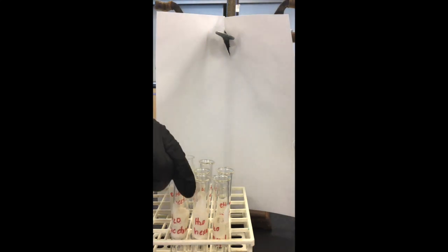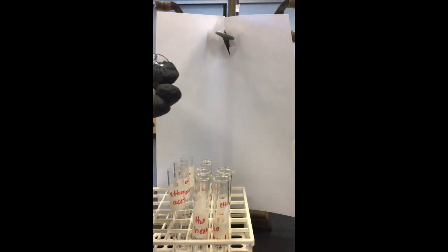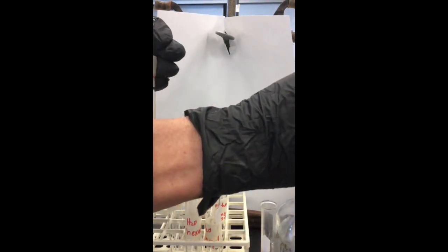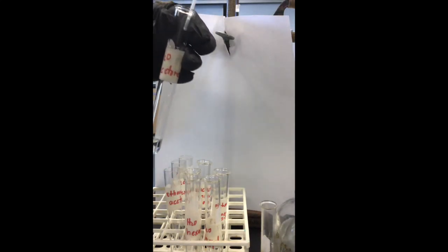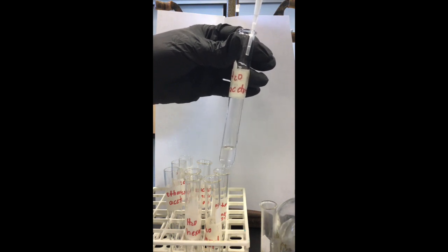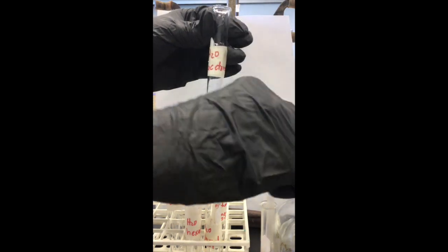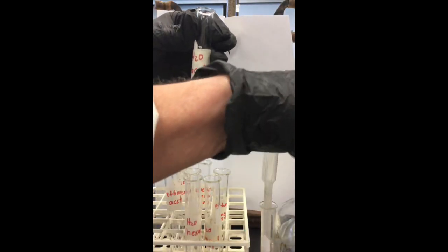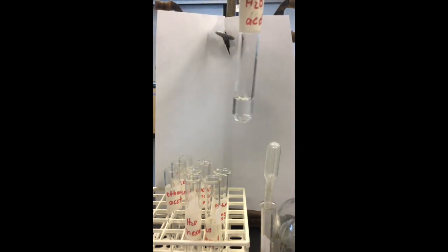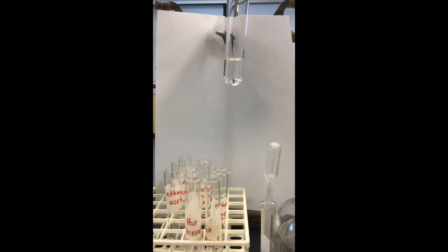The next two solutions I'm testing are water and acetone. Now the water I've already put in here. So again, I'm going to do the equal quantity, and I'm putting in acetone. One thing that's important when you're doing this lab is to make sure that you start with test tubes that are clean and dry. So if you have something else in your test tube already, that may alter your results. So again, I'm going to mix it up and then determine if we see 2 layers or not to see if it's miscible.